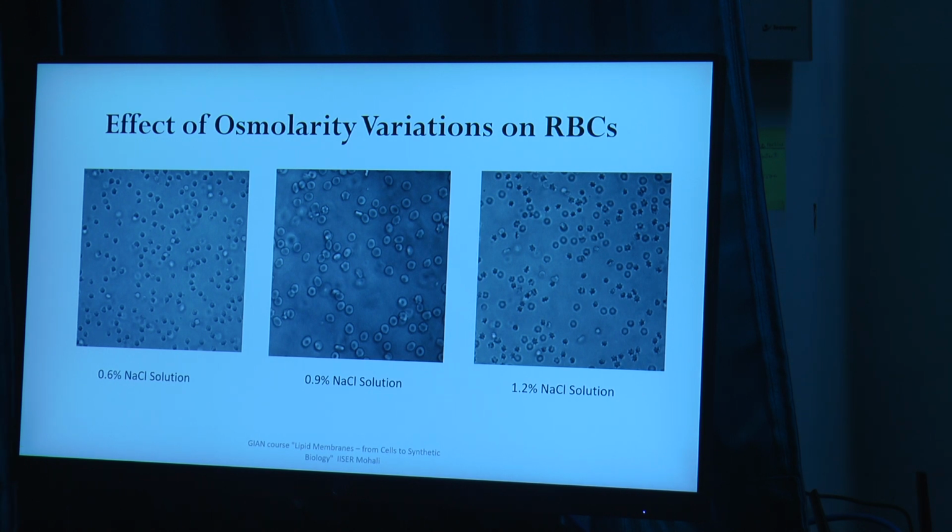Now, like I was saying, when we are maintaining the red blood cells, there is a particular isotonicity which is supposed to be maintained. Osmolarity is supposed to be maintained. And why is that? Because the red blood cell is actually going to react to the salt solution which is outside, and we have listened in our previous lectures where Na+, K+ and all the ions are going to go inside and out. Now, when there is change in the osmolarity from inside out, there is change in the concentration levels inside the cell and outside the cell.